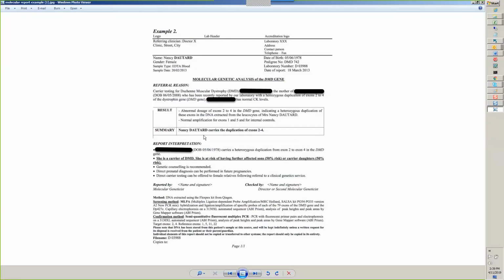And there's two instances here now where I see the patient's name, but these places, I believe, have the patient name or in this case, the offspring of the patient. And so this was an example of where not everything was correctly redacted. That's all right. Examples of what not to do are just as good.